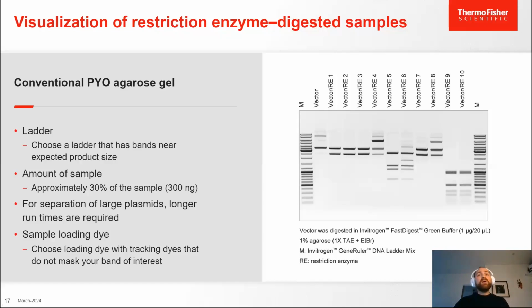So 300 nanograms of that reaction should go into the electrophoresis just to determine whether you have a proper result. And that has reasons, namely because smaller fragments are less bright in electrophoresis than larger fragments. So you have to have significant amounts of both for them to be visualized at the same time properly, without the larger or brighter fragments overshadowing the smaller, fainter fragments.